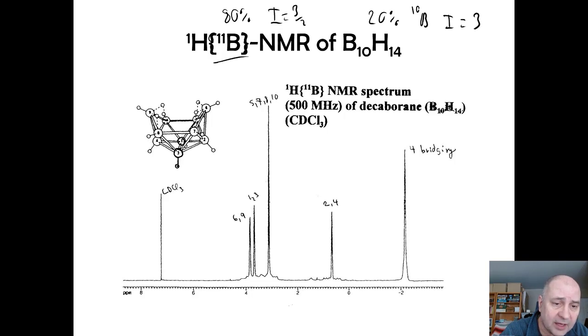That means these two hydrogens would show up together, and I've labeled that here, 3 and 1. That would be this signal, and so you can kind of see that here. 2 and 4 are together, and then these 4 are all chemically equivalent. They show up here for another singlet, and then we also have those bridging hydrogens, which are here.